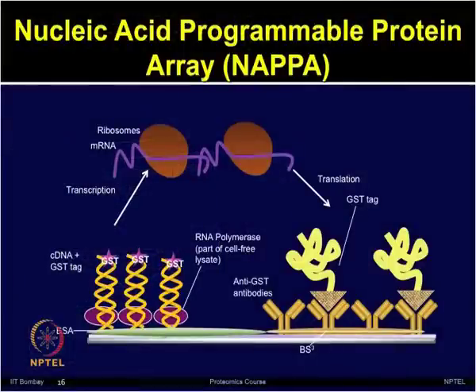The cell-free expression system such as rabbit reticulocyte lysate, amino acid mixtures, T7 polymerase, RNase inhibitor, etc. are added on the chip surface, which contains these spots, and as I mentioned, each spot contains 4 components. Now, after incubating these arrays at 37 degrees for 90 minutes, followed by lowering the temperature to 15 degrees, this process helps the protein expression and protein capture.